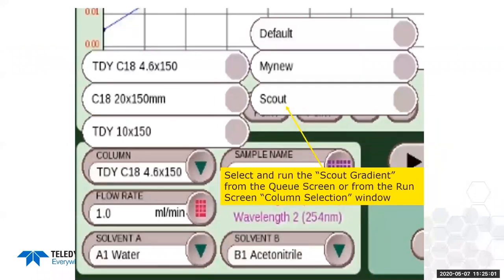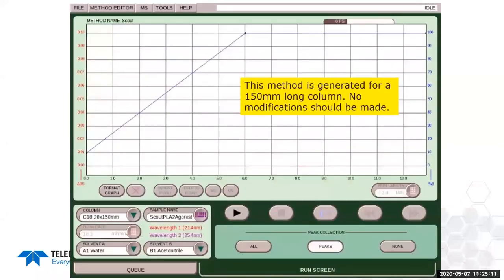Back on the main Acuprep screen, select your column and choose the scout method. It generates a method with a six-minute gradient for a 150 mm column (longer for a longer column), followed by a washout phase to push everything off the column. The scout method locks you out of changing gradient parameters since the gradient profile is built into the algorithm — this keeps the algorithm correct. You can still make detection changes in the method editor.